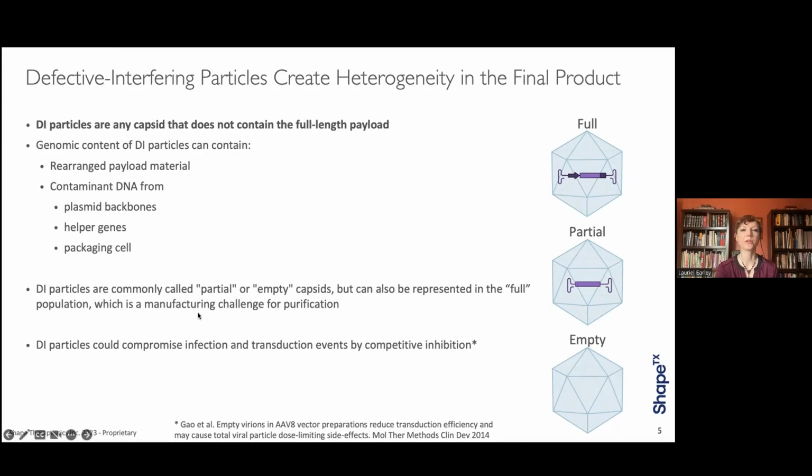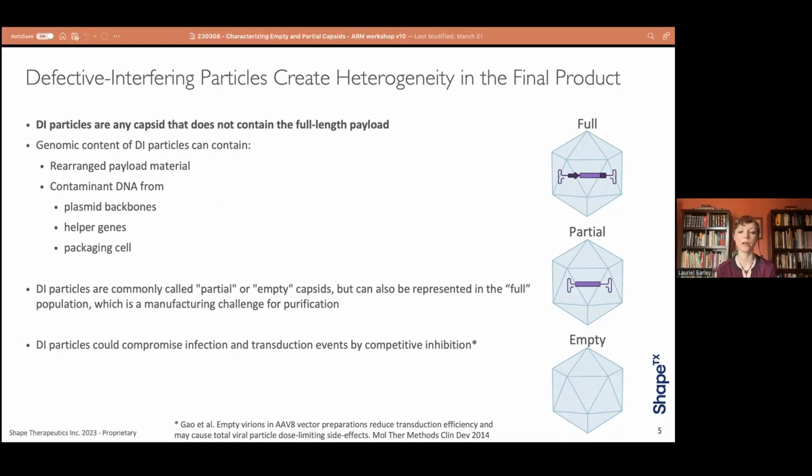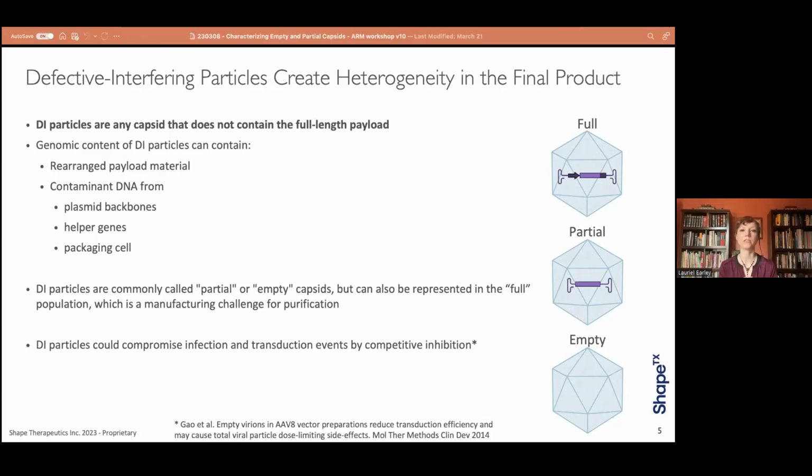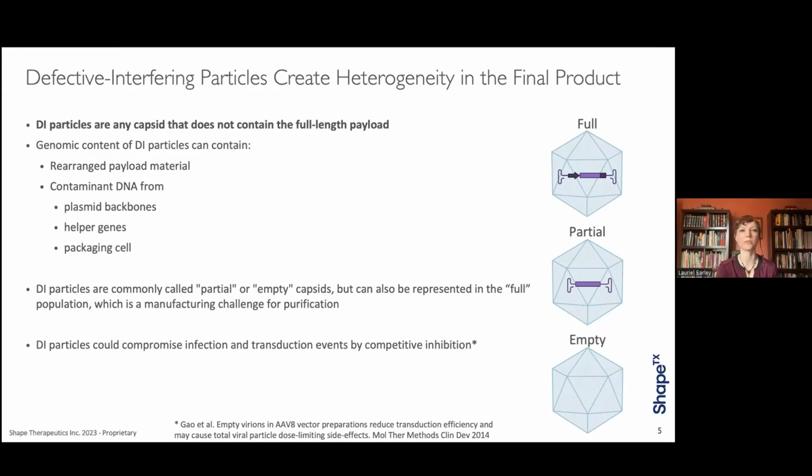Now, defective interfering particle is a term that comes from virology. These are naturally occurring in any viral production setting. And what happens with these is that because they can't produce a productive infection, they're called defective, and they have been shown in tissue cultures to be inhibitory towards other viruses by competing for transduction pathways. Now, we don't know if that would be the case with AAV or in an in vivo setting, but I think the name could still apply here because they are similar to what we see in wild type viral preps. And these have even been found in wild type AAV preps as well.